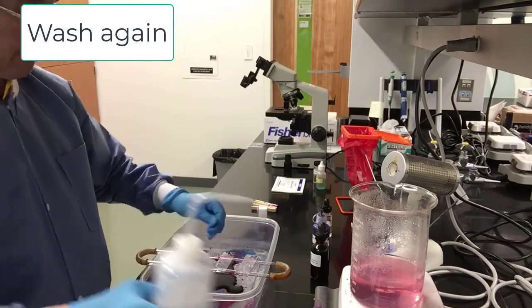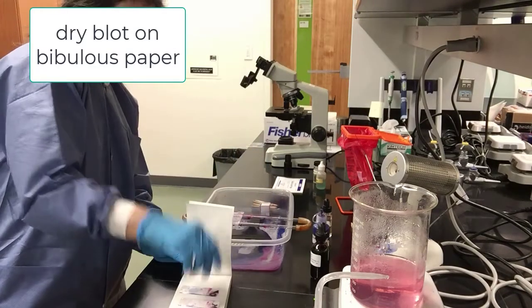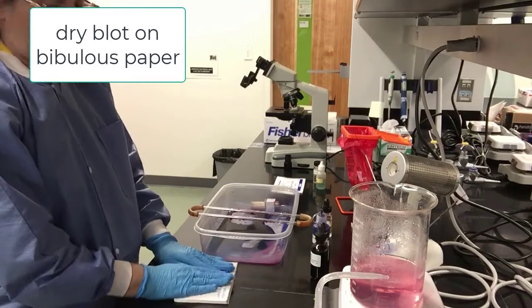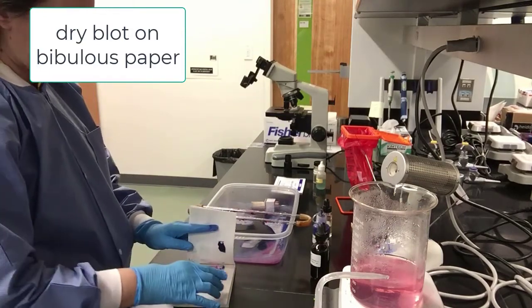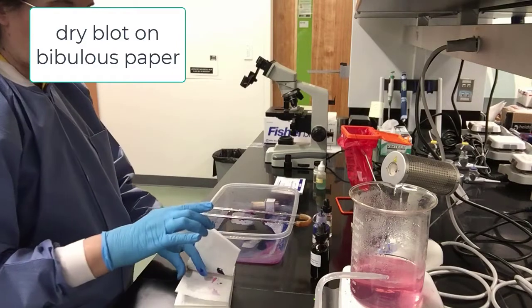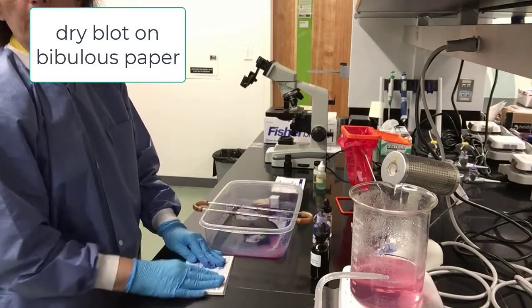And now all 3 slides have gone through the acid-fast staining procedure. Put these slides between 2 bibulous pieces of paper and pat them dry. Sometimes they're still wet and you may need to put them between 2 more pages of bibulous paper, like in this case. And we pat them dry with a bibulous paper.